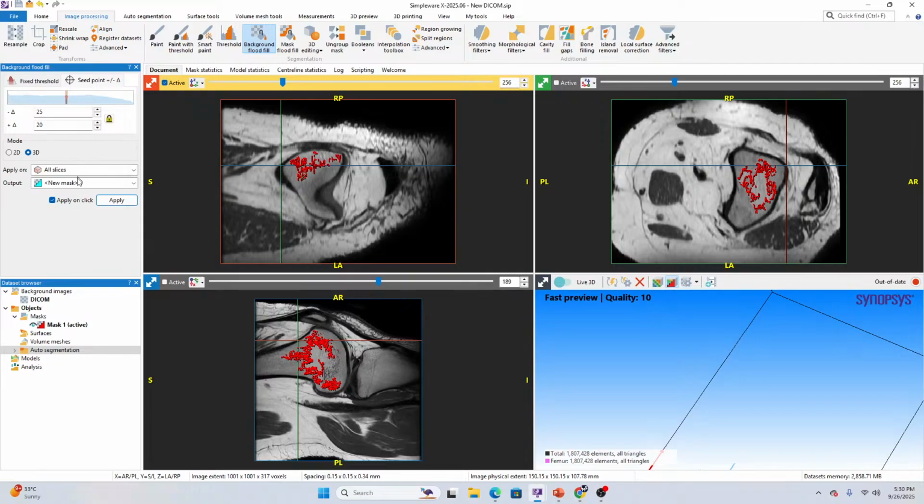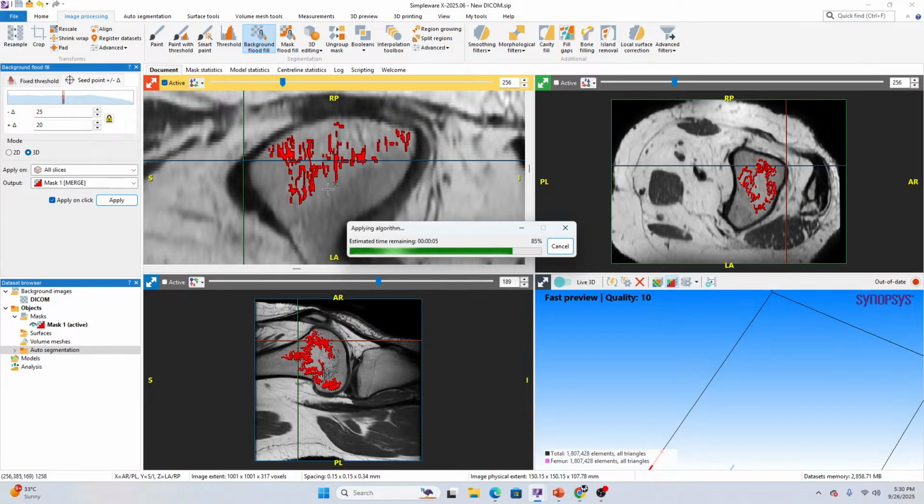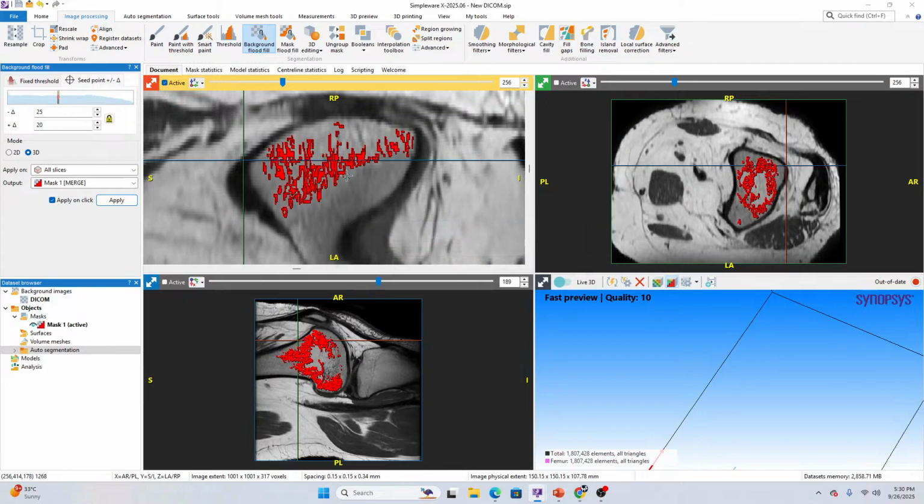To cover that, we need to select the merge operation, and clicking on the merge operation is similar to using a region growing operation. We can easily identify the different regions, and ultimately develop the model out of it. It takes some amount of time, but it's still a better approach than using a paint with threshold tool or a normal threshold, which will also carry a nearby region.